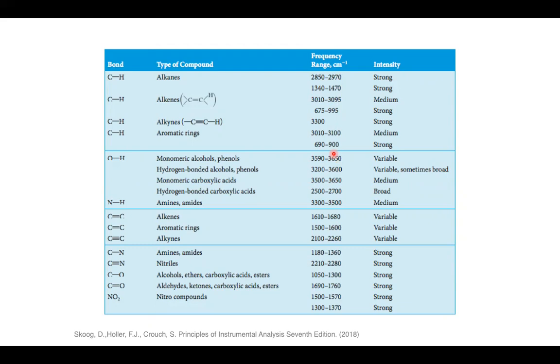Usually, for example, if this was a problem in a quiz or an exam, there wouldn't be that many of them, probably just one per exam. You'd be given a table of common frequencies to use, and then be asked to try and assign the molecule based on your knowledge.